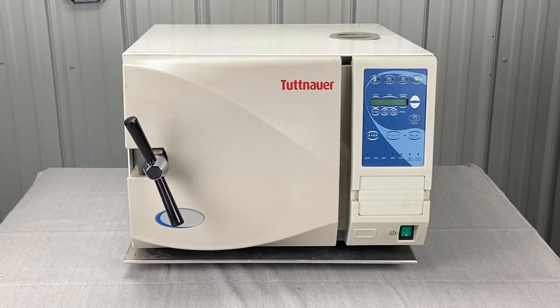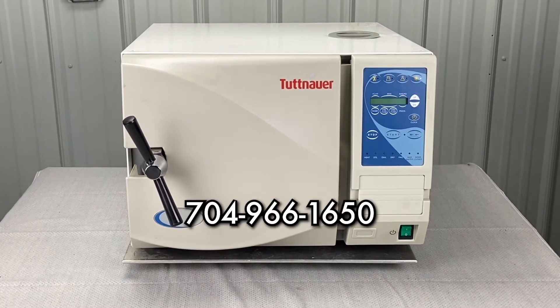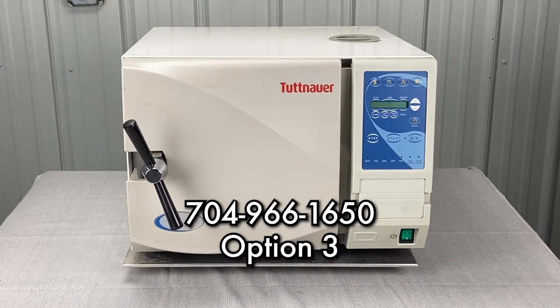Andrew here, Sterilizer Autoclave Solutions, 704-966-1650, option three for free tech support.